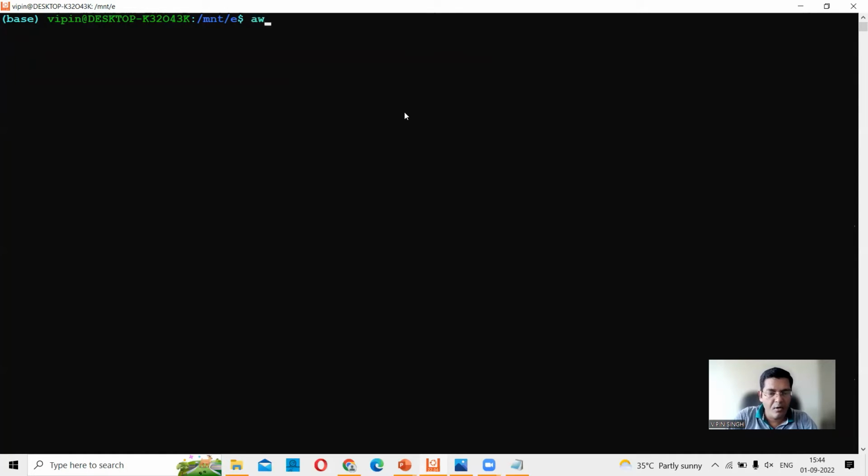So we say again awk, and then open the apostrophe, then we say END, and then we say print NR divided by 4, close the curly bracket, close the apostrophe, and you mention the file name, and you press enter, and that should give you the total number of sequences that are there in your Fastq file. So here you are, this is 2,35,907, and this is exactly 1/4 of the total number of lines that are present.